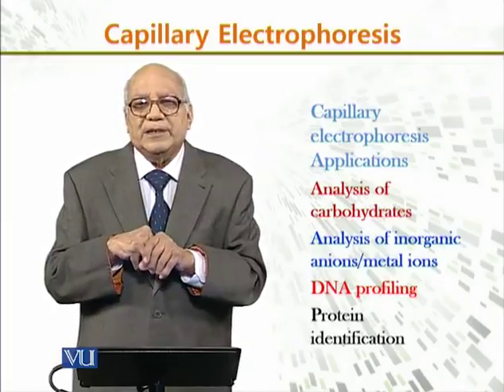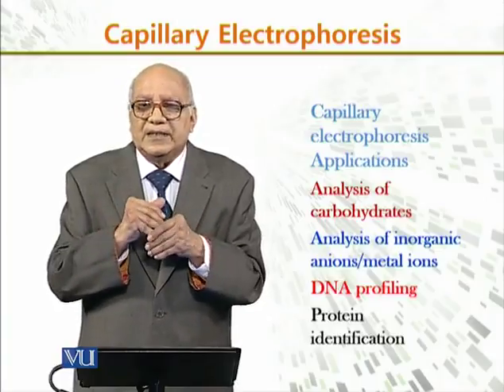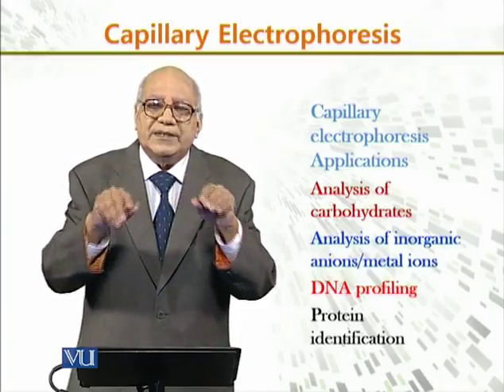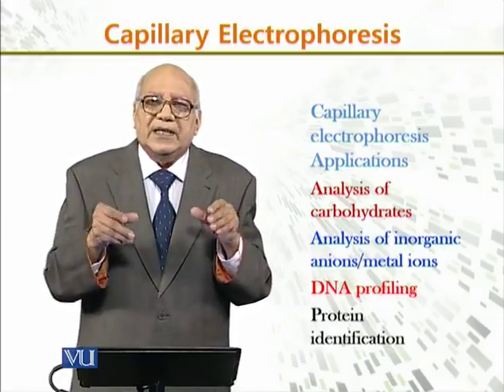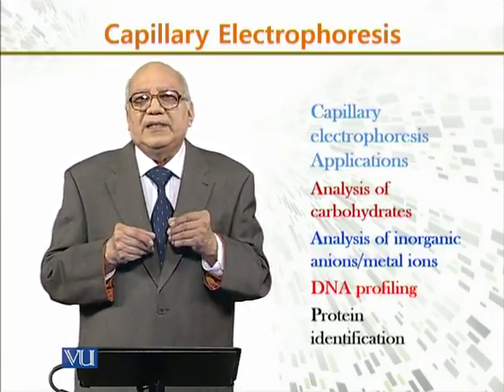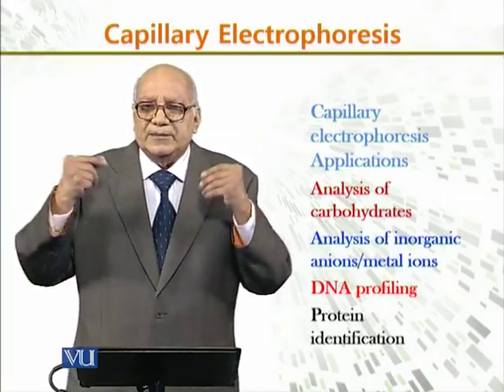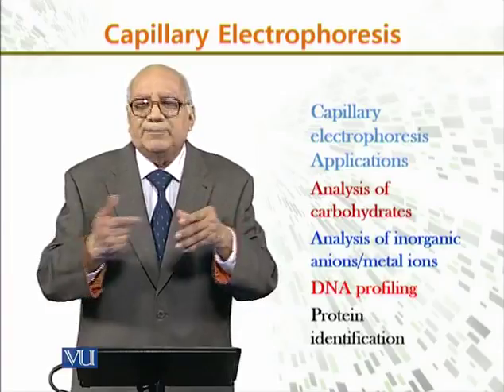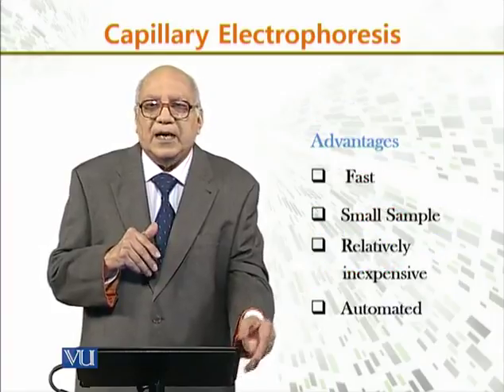Capillary electrophoresis applications are the analysis of carbohydrates, analysis of inorganic anions and metal ions, DNA profiling, that is, how the DNA exists there, and protein identification. So now you can see that capillary electrophoresis is a very versatile analytical technique, where biomolecules, carbohydrates, DNA, anions, metal ions, DNA profiling, and protein identification can be carried out.